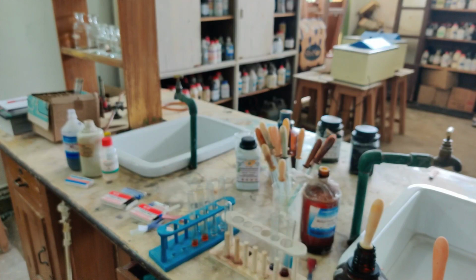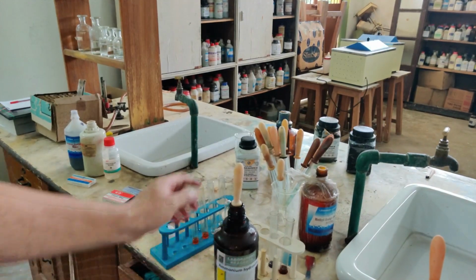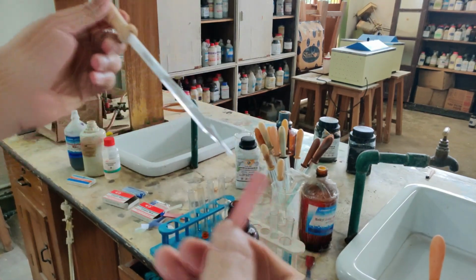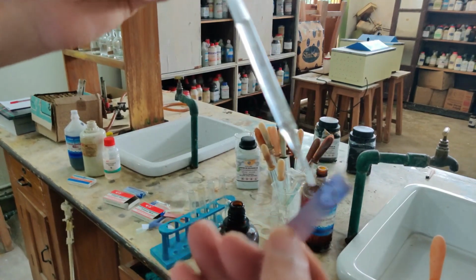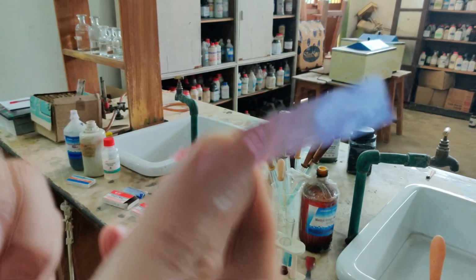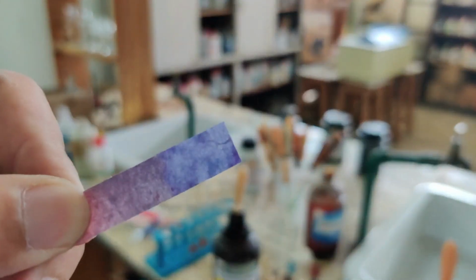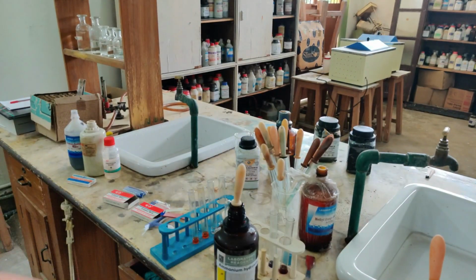So for a basic solution, I am using again ammonium hydroxide. Here is ammonium hydroxide. If I am using this ammonium hydroxide, now you will see how the color will change. Let me add it dropwise. See how the litmus has turned its color to blue. It was a red litmus, but then the red litmus has turned blue. You can see what a nice blue color it has turned to. So this is how the paper works.